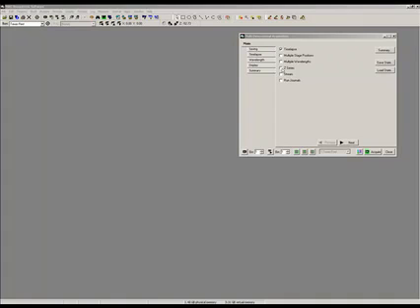This is a quick movie on how to use the multi-dimensional acquire window for Metamorph. The multi-dimensional acquire window allows us to set up any number of operations for acquisition.